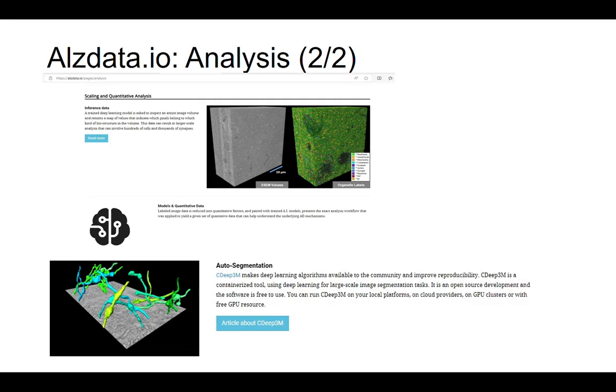Once a deep learning workflow has been successfully applied, we are able to produce rich data reconstructions that reveal intricate cellular details, with an example provided in the reconstruction data section. Additionally, we offer further sections that display what the deep learning inference data looks like and how this data can be quantitatively measured. You'll also find links to computational workflows that can assist researchers in navigating and utilizing this valuable information for their own studies.